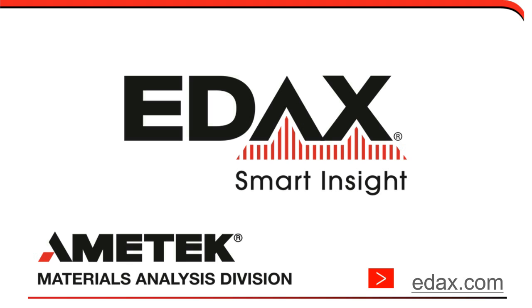Every sample is a little bit different, providing a little bit different intensity coming off of the sample going to the phosphor screen, and in that case, the contrast mechanisms and the contributions from the different mechanisms actually affect quite markedly what the images are. So that's the one advantage, is you do have all 25 of those images, and it's easy to click on each one and survey what each one is and see if it has the contribution that you're looking for or excludes the contributions that you're not interested in. But one aperture does not fit all.